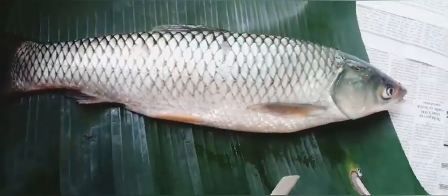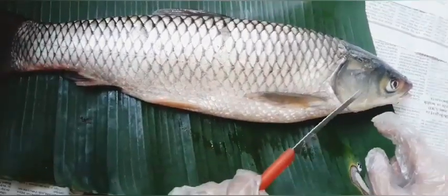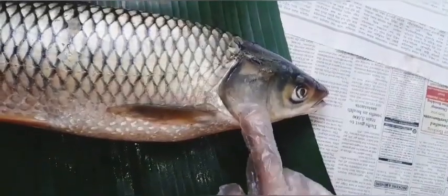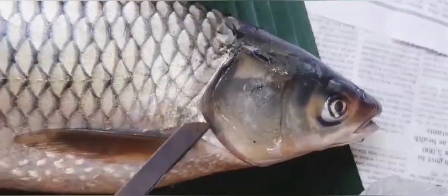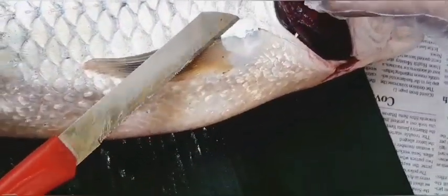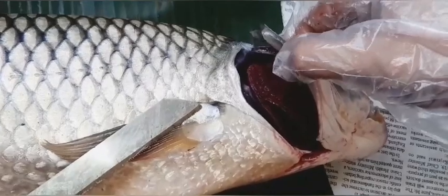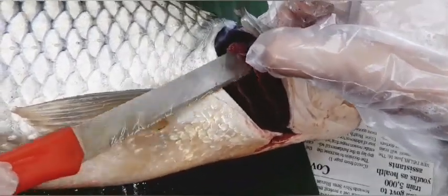Now let us come to the operculum. So the operculum is a covering and it is used to cover the gill slits. Inside this operculum there are some gills. I have cut a little so that the gill slits will be visible. So maybe this is visible. So these are the gills of the fish.